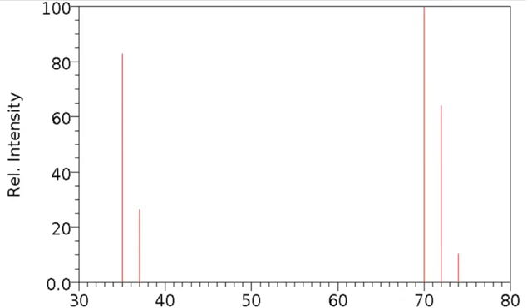We see the biggest peak is at 70. Go ahead and look on your periodic table, pause the video, and figure out what element this would be, and then talk with your partner about what causes the other peaks. So we've got a 35 and a 37. That one is chlorine 35, and this one is chlorine 37. Different and common isotopes of chlorine.